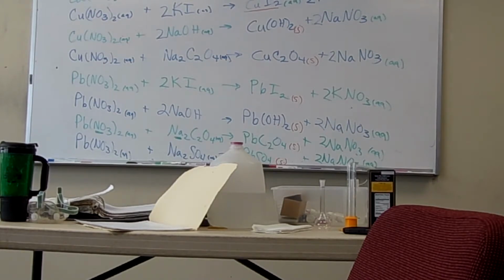And do we see a reaction there? No, it's very hard to tell which one. Nice of them to make potassium iodide carry on the label. So if we did the other ones, you can see that one didn't form a precipitate, it's just all aqueous.